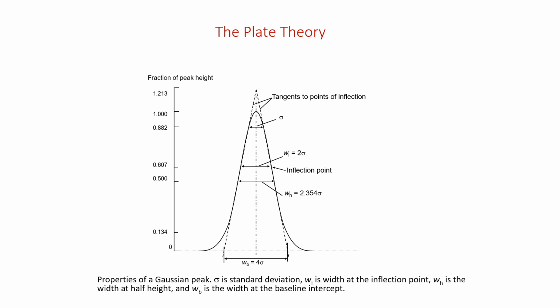The plate theory can also be used for peaks. Remember, before this I introduced to you the meaning of theoretical plate, because it's the theory. It is actually only theory. It does not exist per se, but it comes from fractional distillation, remember?